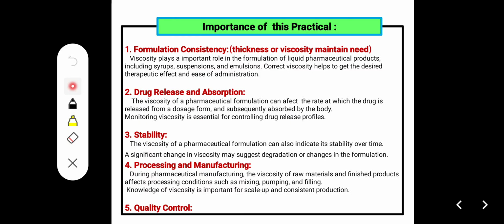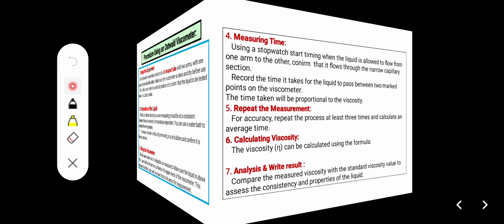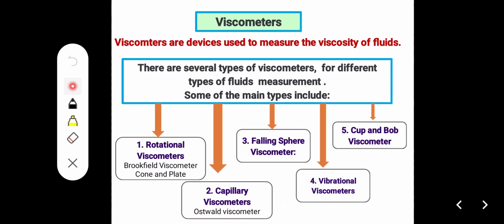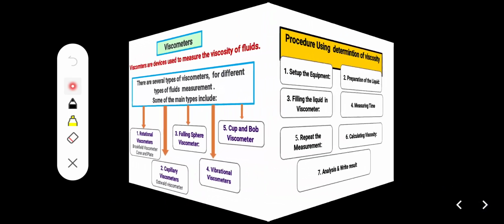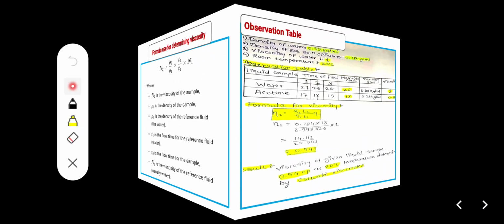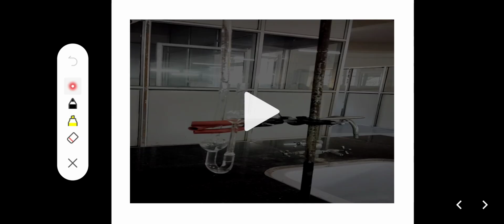So this practical is helpful to understand the applications, formula, how to calculate, procedure, different types of viscometers. Next, watch this practical so you can clearly understand.